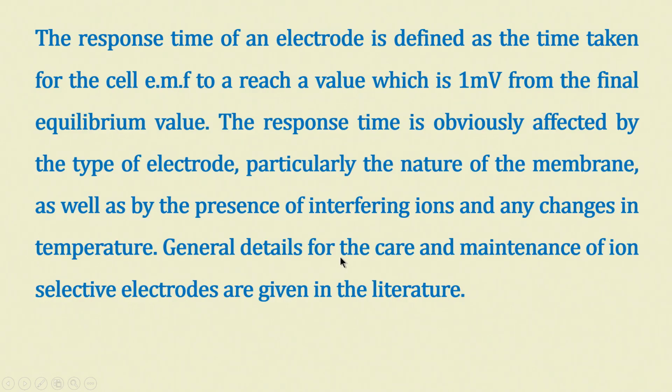The response time of such an electrode is defined as the time taken for the cell EMF to reach a value which is 1 millivolt from the final equilibrium value. The response time is obviously affected by the type of the electrode, and particularly the nature of the membrane, size of the membrane, thickness of the membrane, structure of the membrane, and all those parameters that define the characteristics of a membrane.